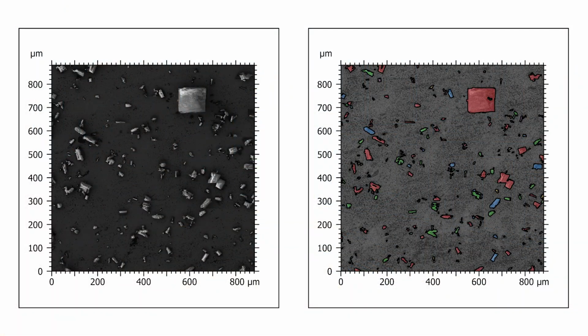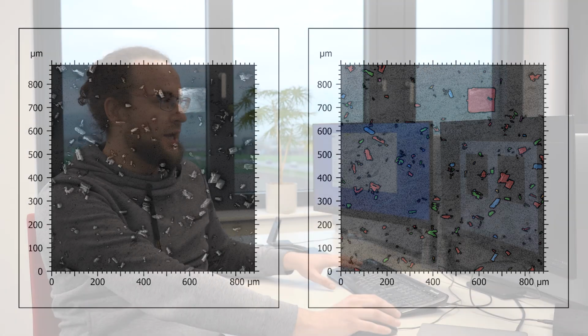What I did, I can show you here. I took an SEM image of this particle, and what you can see is that there are completely different sizes of particles and distribution of these particles. The next step is, okay, I would like to know the roughness of these different particle sizes. Are there any differences? Therefore I used the AFM, the atomic force microscope, to measure the topography.